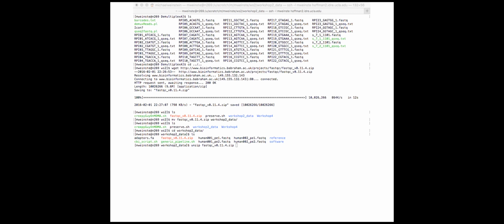It most likely is either there was something weird with the way it got copied in there, or alternatively, there may have been an issue because everybody was trying to download it once or something. So give it another couple tries. It seems like the site is valid, so it should be there.